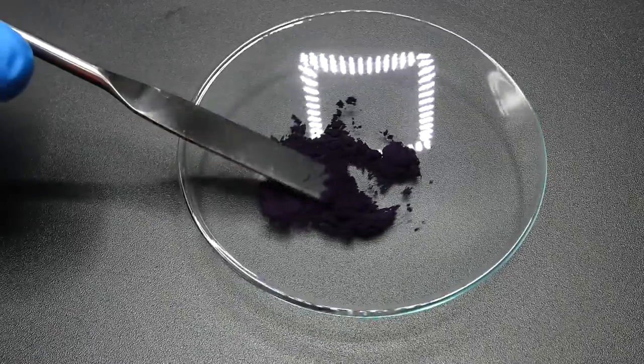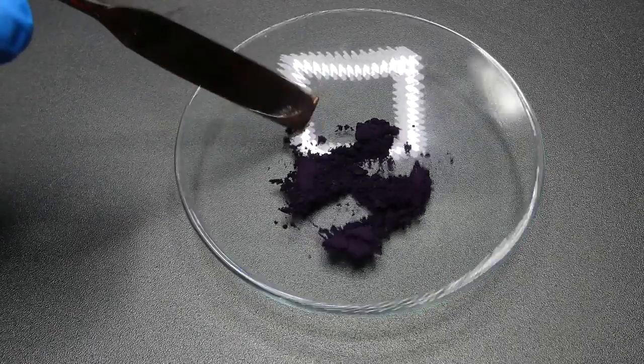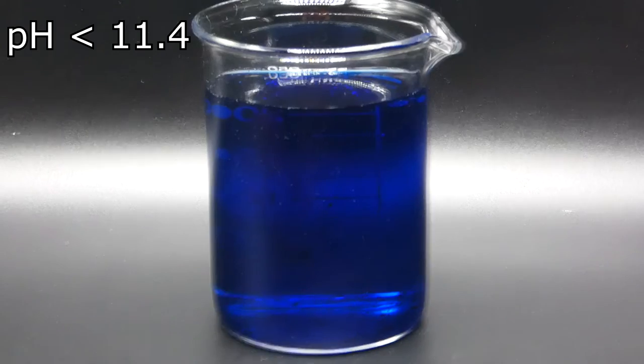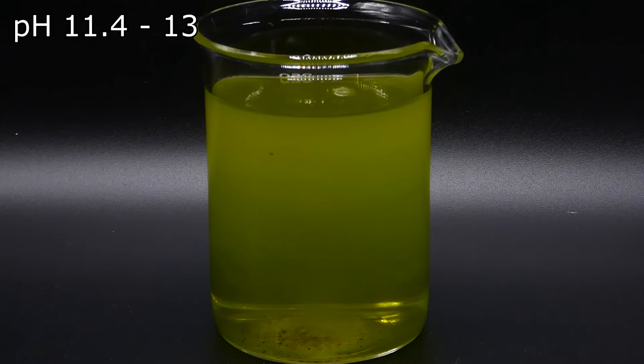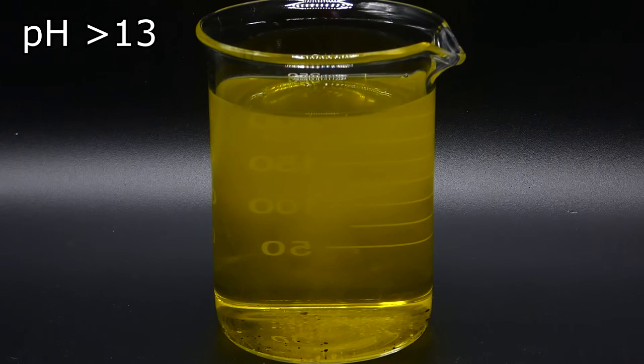Firstly, this dye is used as a pH indicator. When the pH is around 11 or less, the dye is blue. Between 11 and 13, it is green. And when it is higher than 13, it changes color to yellow.